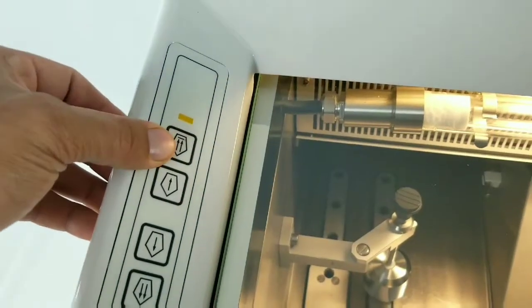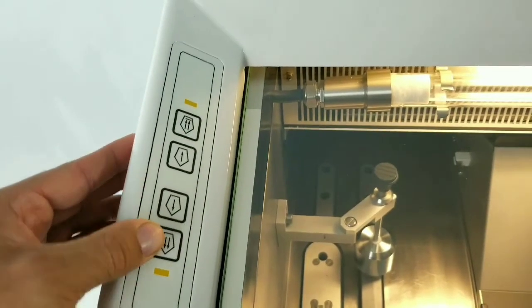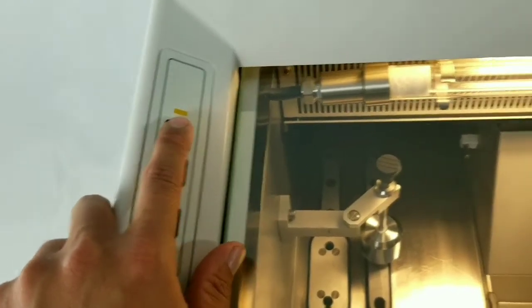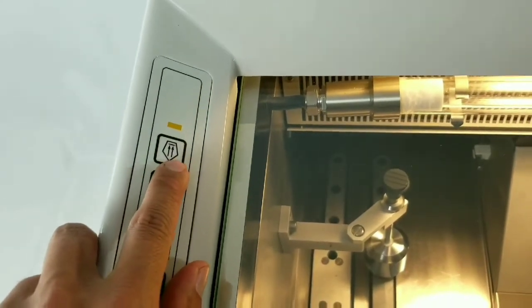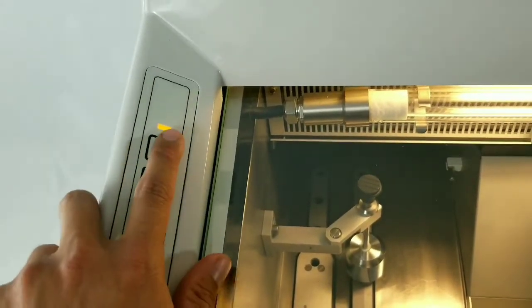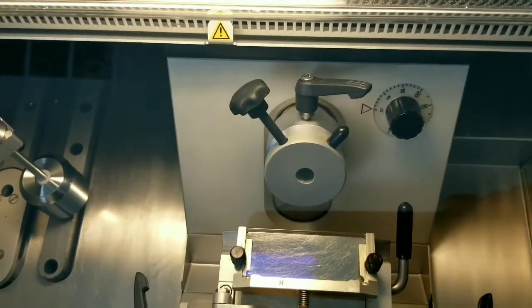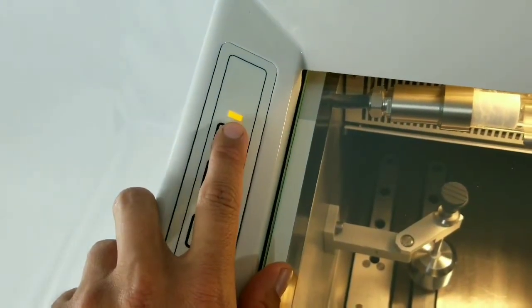These buttons over here control the specimen head advancement and retraction of the microtome. This is your coarse retract, fine retract, fine and coarse advance. When it's fully advanced, this LED will illuminate, and when it's fully retracted, this LED will illuminate as well. When you press the coarse retract, it will naturally want to home, so this will blink until it actually gets to its home position and the furthest retracted position, and once that happens, this will illuminate solid.